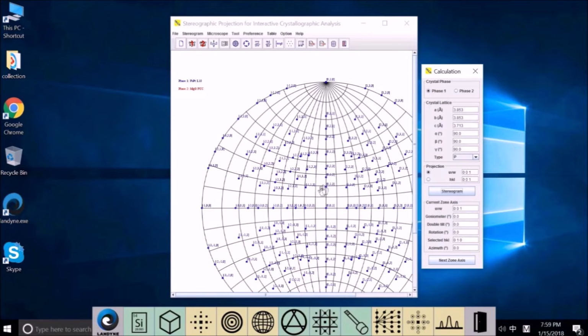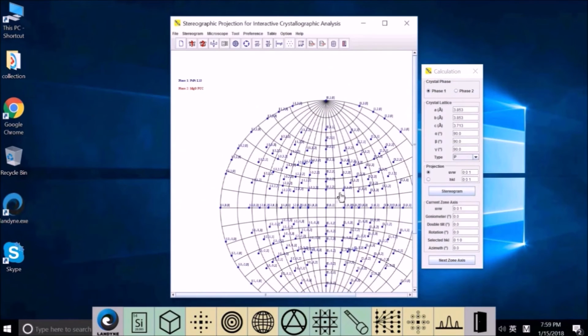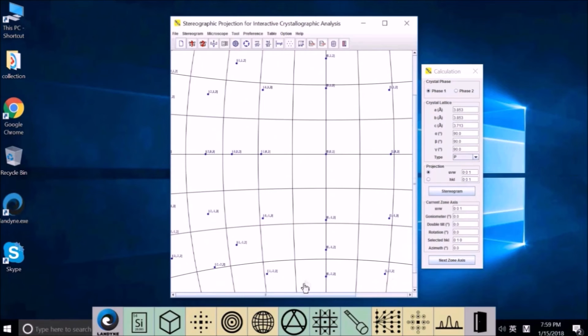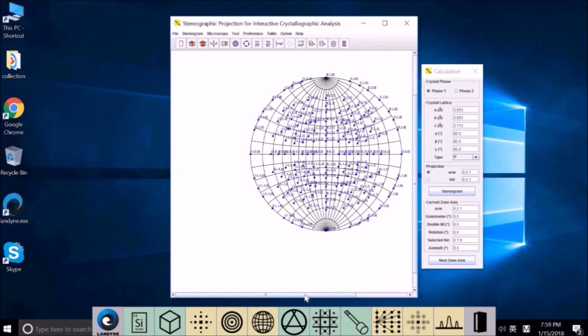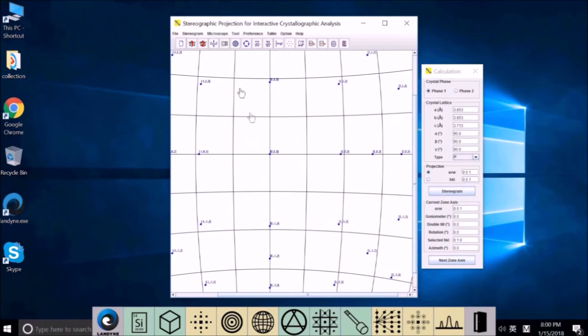If you want to show just one region here, you can use the mouse left button, click and slide in and out. The outside bar can also slide to help you. In this way, you can use the performance font to get a big number here.